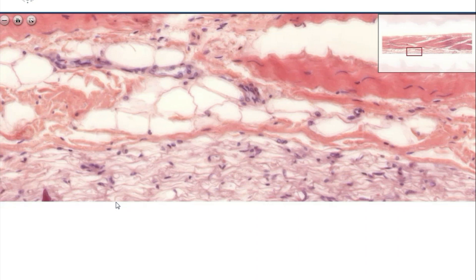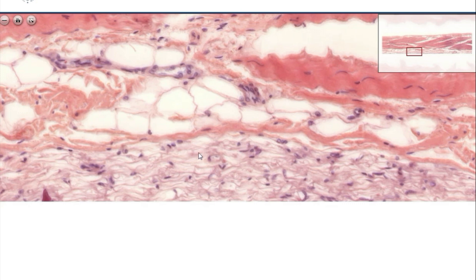On the other side of this slide, you also have fat cells. The fat is dissolved during the technique of the staining, so these are empty rings — only the little cytoplasm, the cell membrane, and the surrounding minimal connective tissue. On the outermost edge of the slide, these fat cells are compressed, so this cage system is compressed, which is why it looks denser.